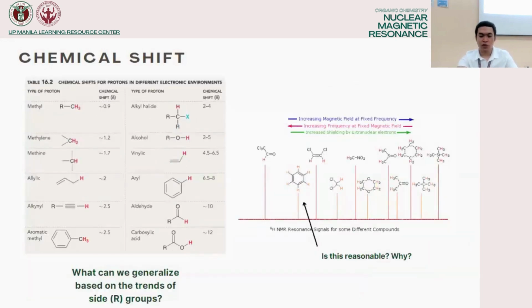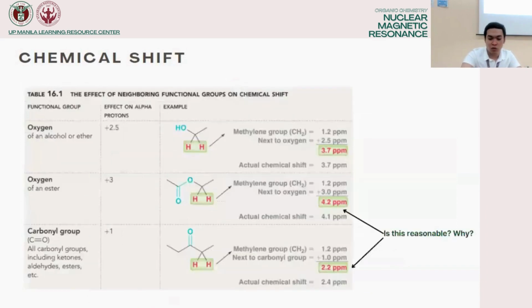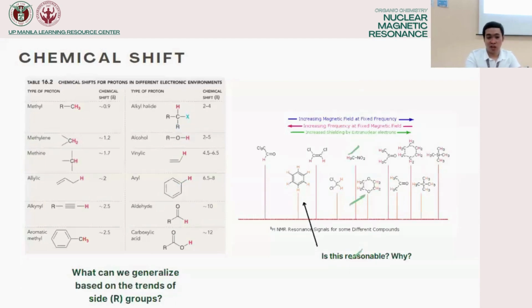So syempre, gusto natin mapadali ulit ang buhay natin. May mga certain values naman. Hindi tayo magka-calculate. Usually, dito kasi kina-calculate yan, pero pag binigyan tayo ng graph, hindi naman tayo magka-calculate. We are after the location in the graph.